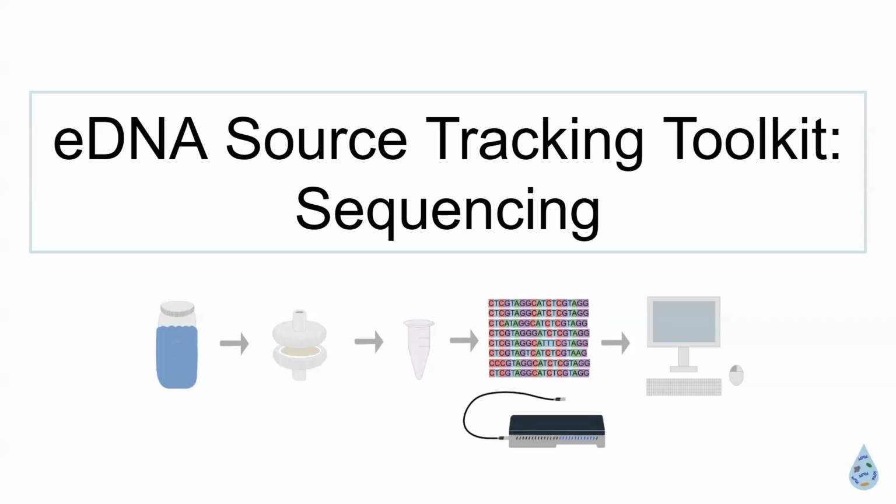Unfortunately, bleach can over sterilize, right? Because it can leave behind a residue that actually becomes a DNase or an RNase, and that's an enzyme that will degrade or deplete the DNA or RNA. So it's great for a hospital that wants to be completely sterile in their surgery field, but it's not good here, because it will leave behind a residue even with rinsing. So simple ethanol works great to rinse your instrumentation.